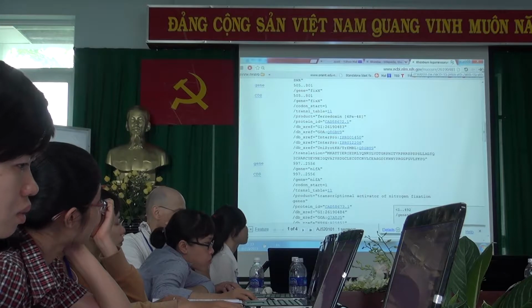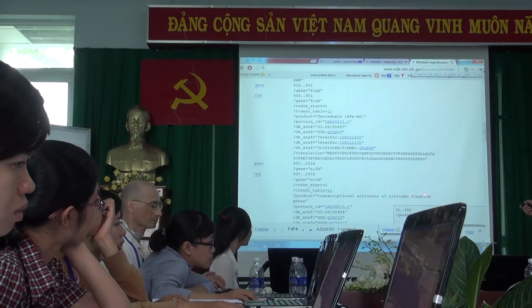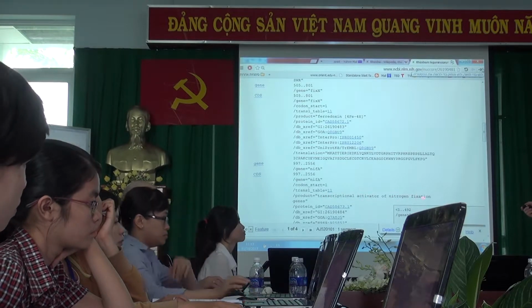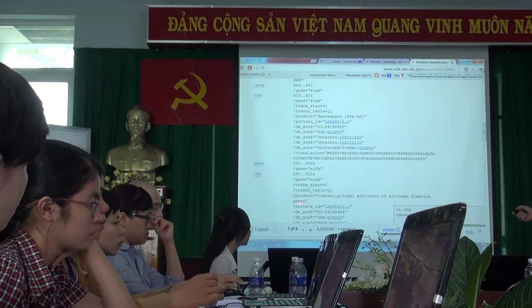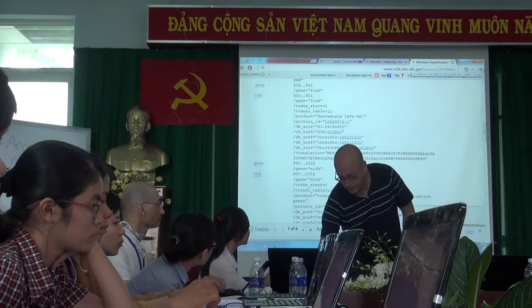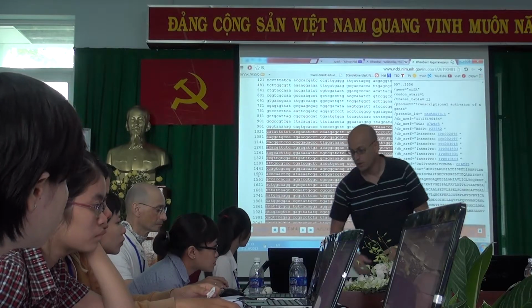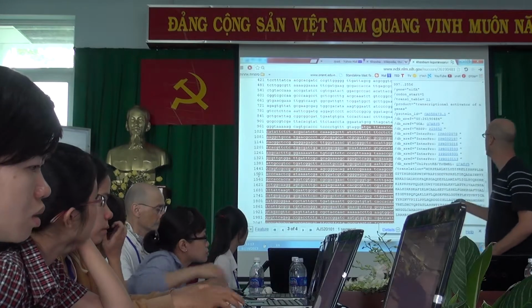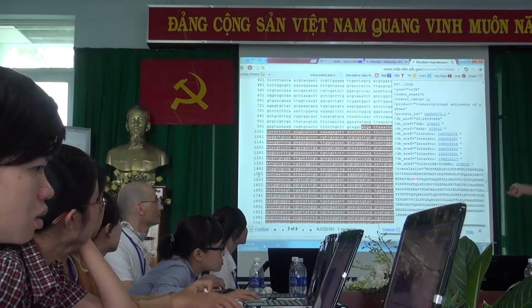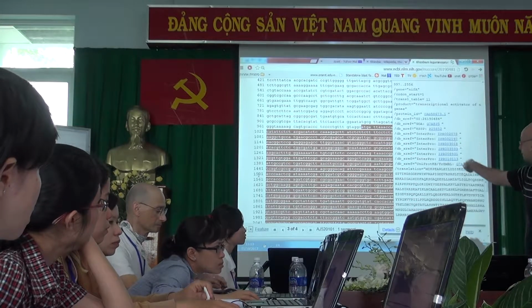This is the NIF-A. And what does the protein do? It is a transcriptional activator of nitrogen fixation genes. And if we click on the coding sequence of NIF-A, we go down here. Here, on the right side, again, we have all the data from up there. It is the same.